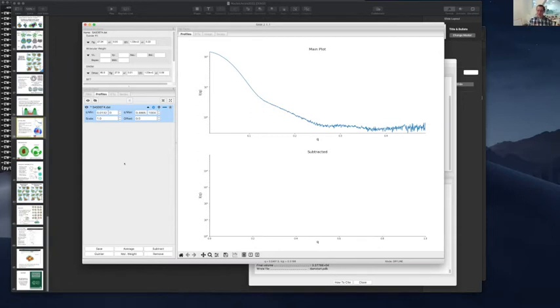All right, so yesterday I believe you guys had a tutorial on how to use Raw and how to generate a P of R curve. Is that correct? You're muted, Mikhail. I don't think we did a P of R function from Raw, but we just showed that it's possible to do in Raw. We have a couple of examples of how to calculate Guinier and plot Kratky, but the real tutorials could happen later in the afternoon. But it's okay. Go ahead. Yeah, no problem.